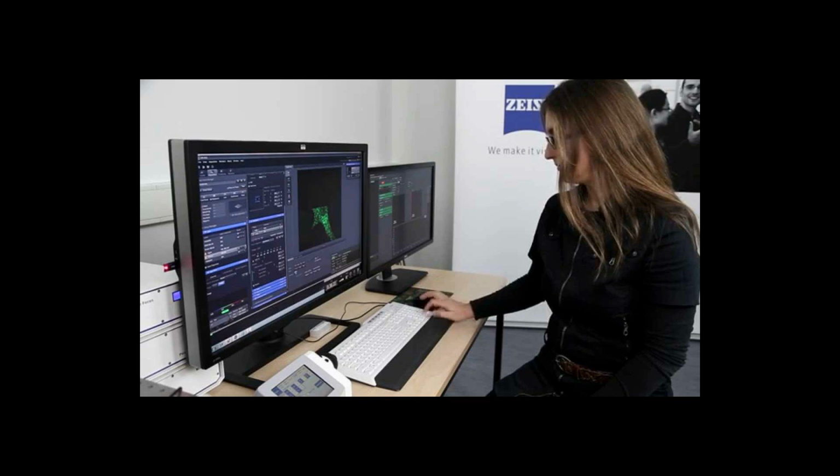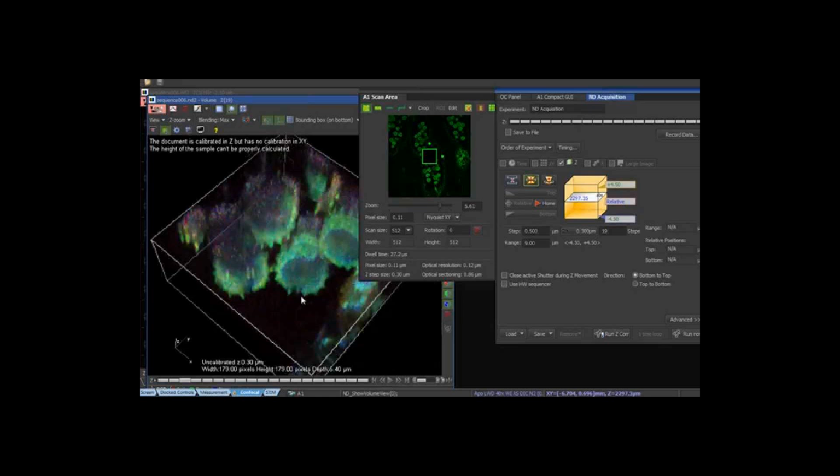Phase modulation. Fluorescence lifetimes can be determined in the frequency domain by a phase modulation method. The method uses a light source that is pulsed and modulated at high frequency, up to 500 MHz, such as an LED, diode laser or a continuous wave source combined with an electro-optic modulator or an acousto-optic modulator. The fluorescence is A. demodulated and B. phase shifted. Both quantities are related to the characteristic decay times of the fluorophore.